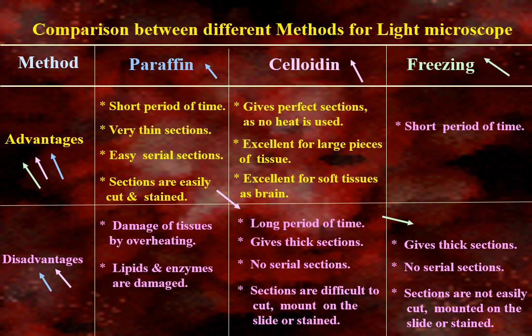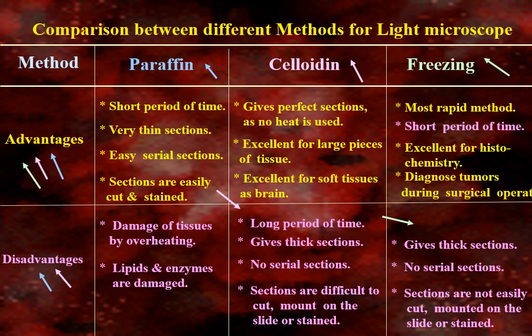Advantages of freezing method are: it is the most rapid method. It is excellent for histochemistry. It is used to diagnose tumors during surgical operations.